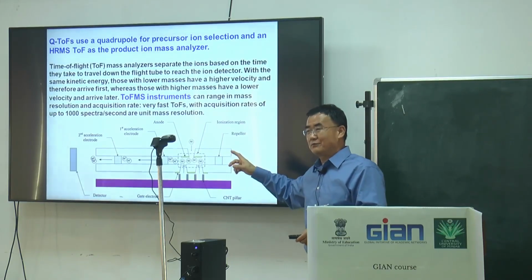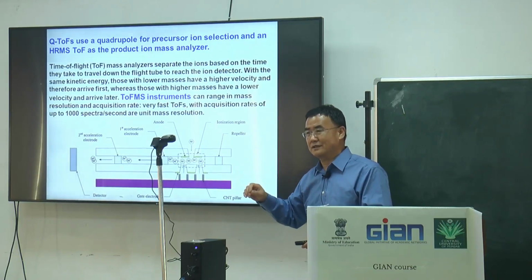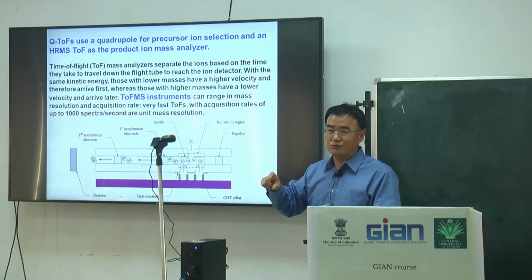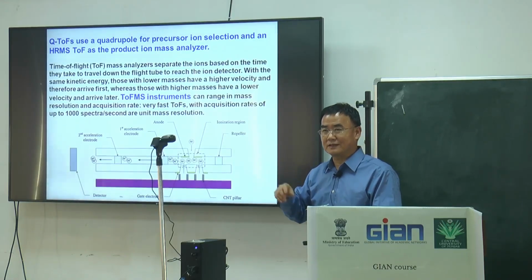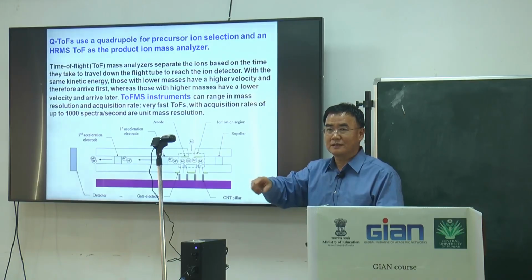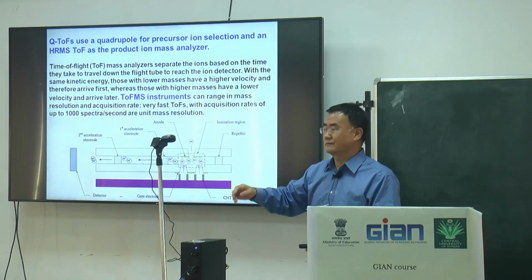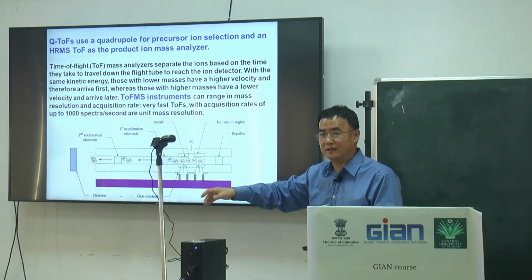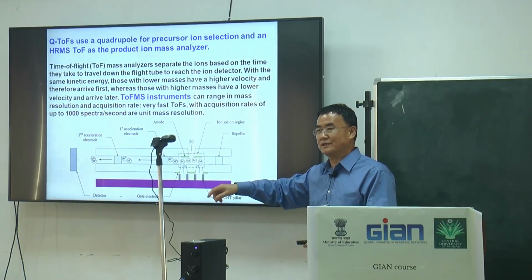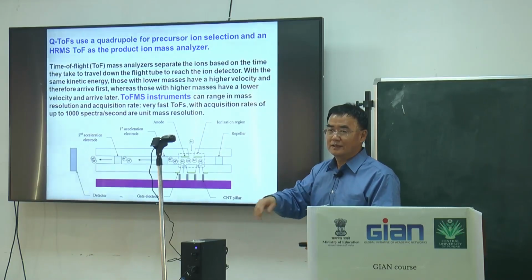Because this has very high sensitivity and very high selectivity, you cannot use too high a concentration. You have to dilute it very well, like a 10-fold or 30-fold dilution from our normal extraction. For example, you use 100 milligrams of fresh sample, then dissolve it in 80% methanol. Then we quickly sonicate under cold temperature.